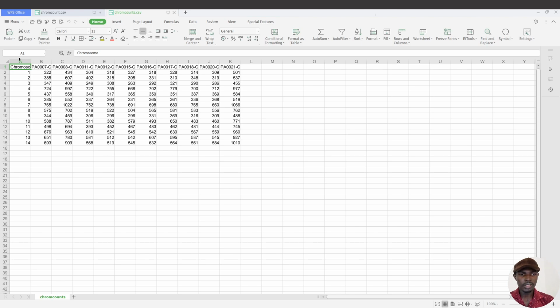If you have it like this, then you can also proceed to generate a heat map, or a bar graph or bar chart, or any other visualization that you deem appropriate. But that depends on you, and it should be done case by case. All right. So that one, I'll leave it to you. But if you want some additional visualizations, you can always reach out to me and we can work something out.